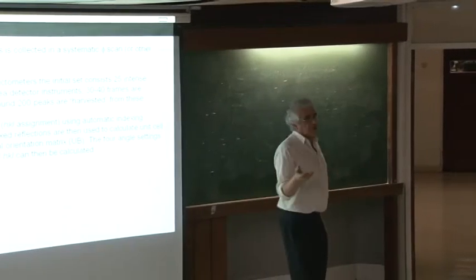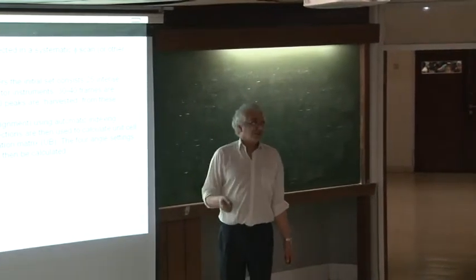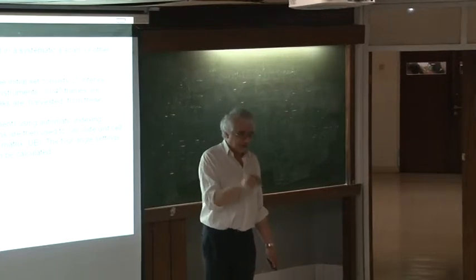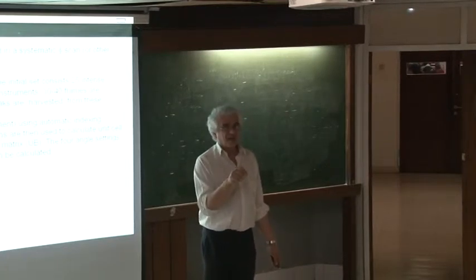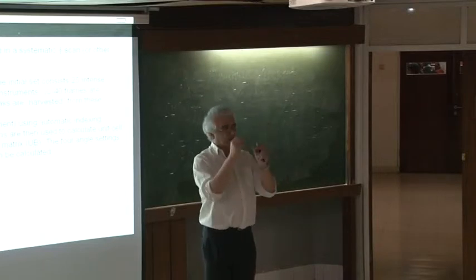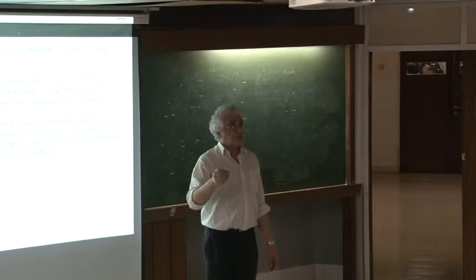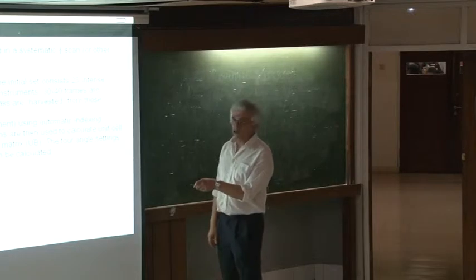Now, of course, how it's orientated depends on how you picked it up when you were lifting it off the microscope slide, and depends on how it froze in relation to the fibre. So that can change every time. Every time you mount another crystal, that matrix is going to change.